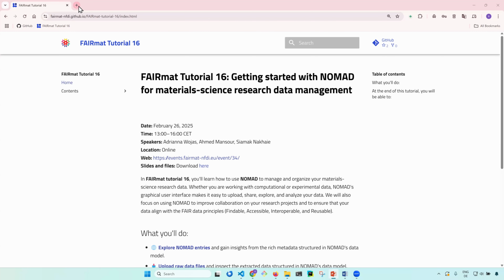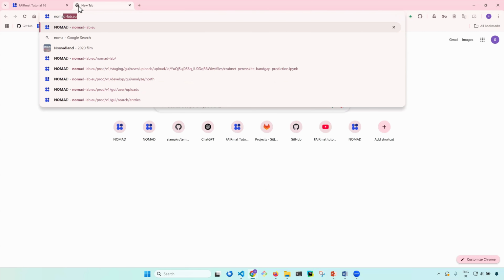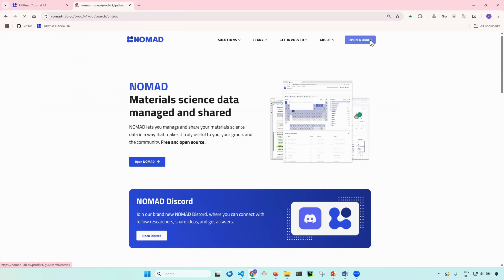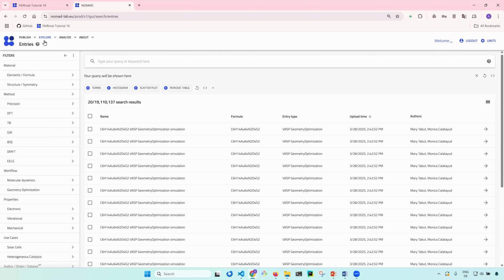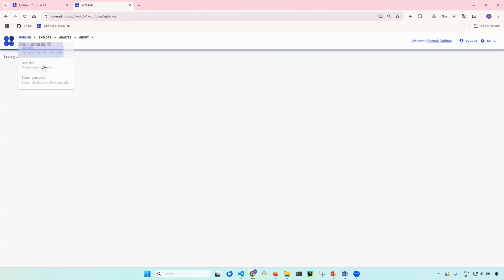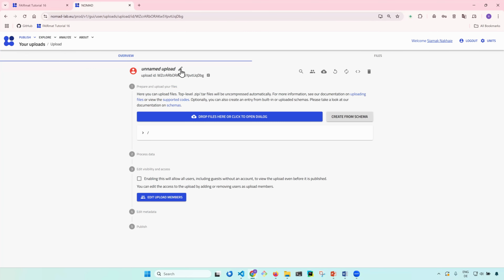So now let's go to NOMAD. And let's start with creating entries. I just go under Publish, Uploads, create a new upload, give it a name.